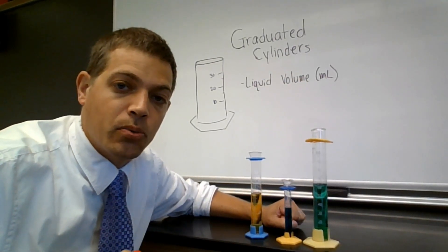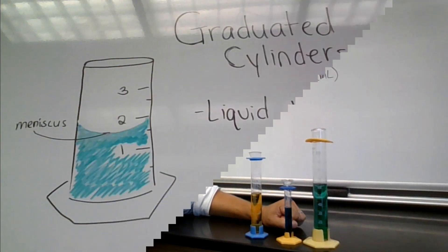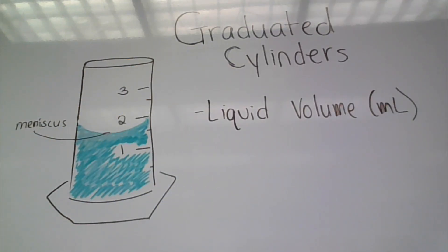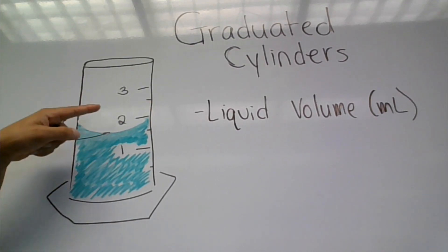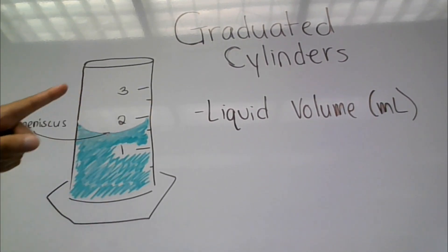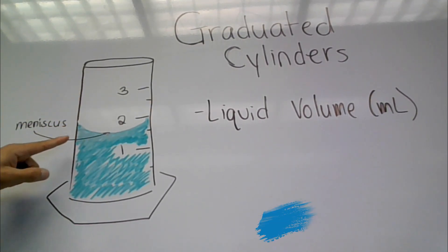Now let's take a look at how to use one. Take a look at the numbers. I want to show you this because not all graduated cylinders have the same numbering system. In this case, we have one milliliter, two milliliters, and three milliliters. We look at the bottom of the meniscus.